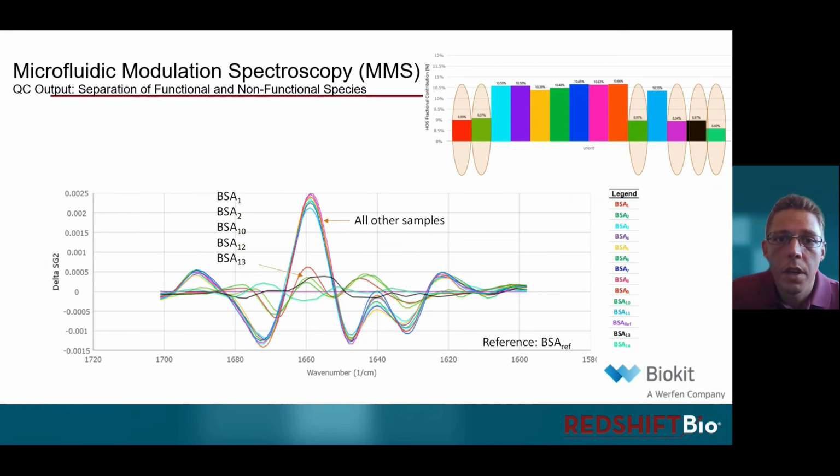a delta plot. So in this case, any samples that follow closely to the baseline should be structurally similar to the reference, and any that deviate from this baseline should be structurally different to the reference. And indeed, we do see this separation. We see the same 5 samples we saw in the pattern for disordered structure following somewhat closely to the baseline.